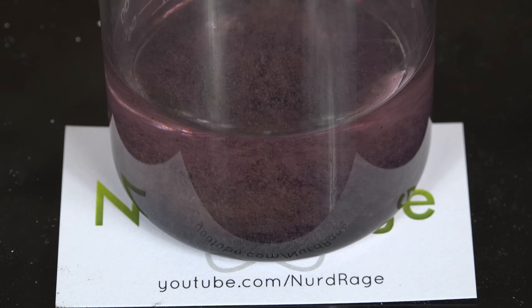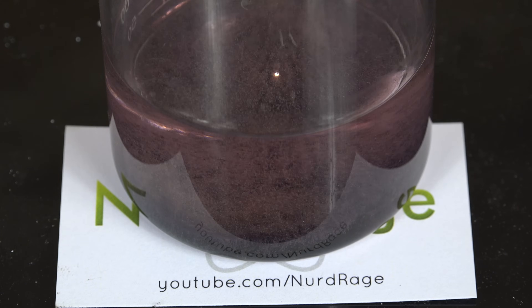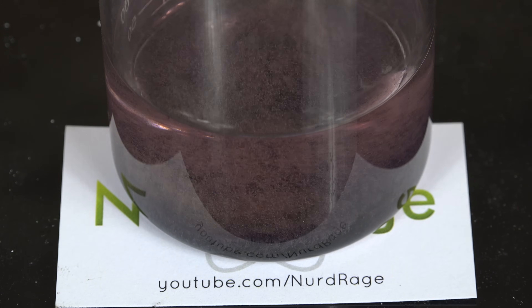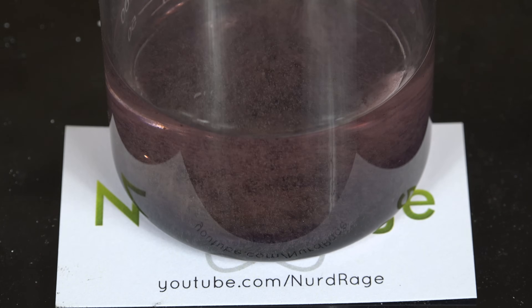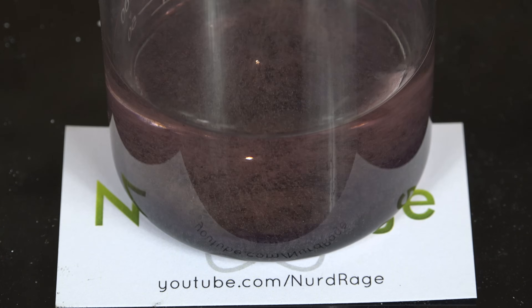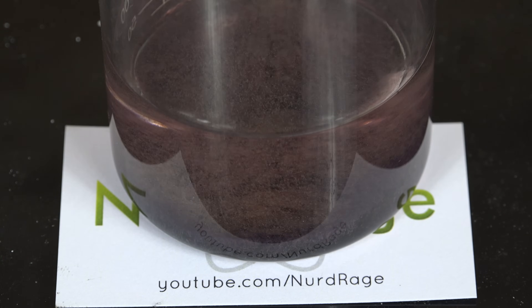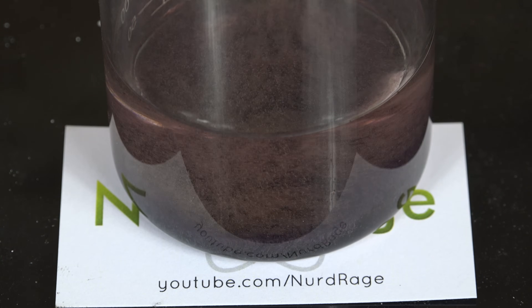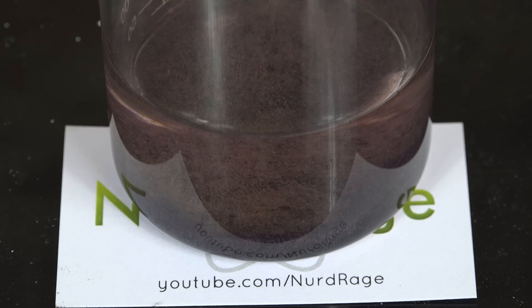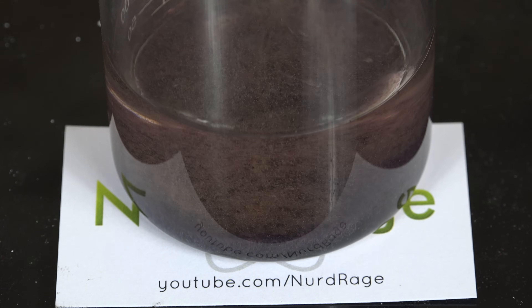What's happening is the sinking potassium permanganate crystals react with the sulfuric acid to produce manganese heptoxide, an extremely powerful and reactive oxidant. The blob of manganese heptoxide floats back up and reacts with the flammable ethanol, making a tiny little explosion. It'll go on for a few minutes and usually stops when it runs out of permanganate, or if the layer is mixed so much that the sulfuric acid is no longer concentrated enough to produce manganese heptoxide.